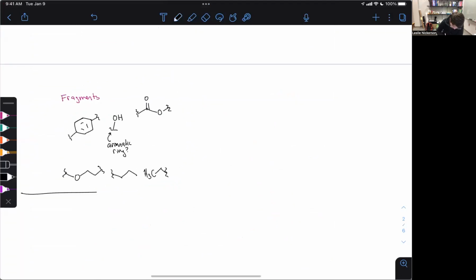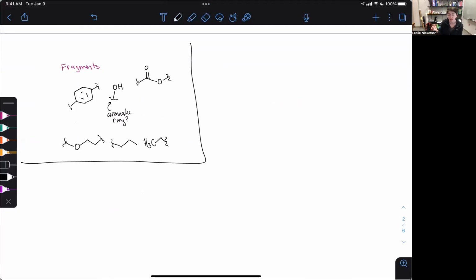Okay, so these are our original fragments. So what we were looking at before, we have 3 pretty clear alkyl peaks. They might be next to oxygen. They might be close to other things, but we're looking at stuff that is probably 3 alkyl peaks, at least sp3 carbons, right, with hydrogens on them. So one of the things that we said was that these all kind of seemed connected in a way where they're all just building off of each other.